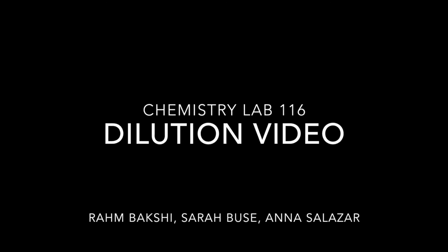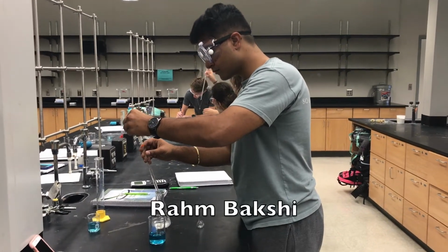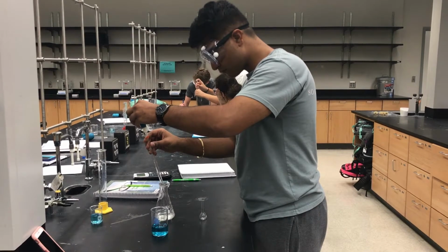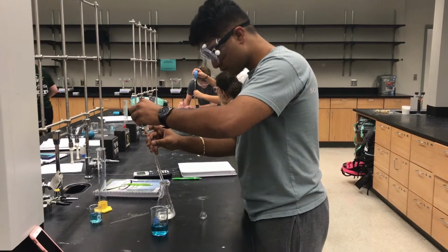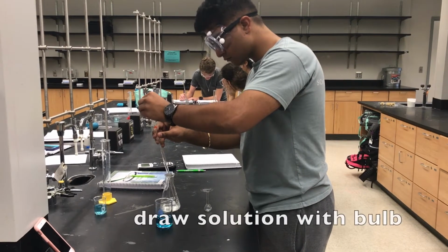Today, we will be learning how to use a graduated pipette and about stock solutions and dilutions. To begin, grab a graduated pipette, a bulb, your stock solution, and water to dilute it. After rinsing the pipette 3 times with water and 3 times with your solution, transfer a small amount of stock solution into a new container.